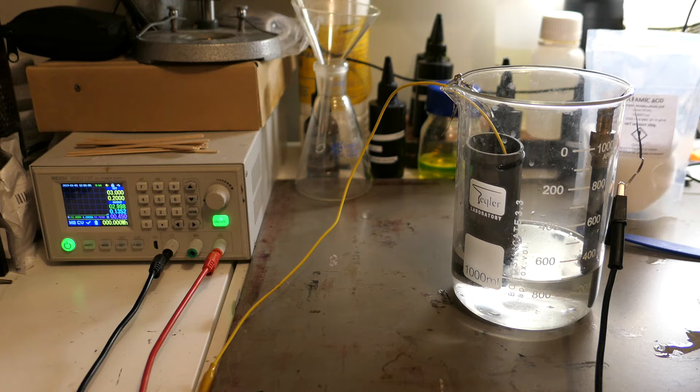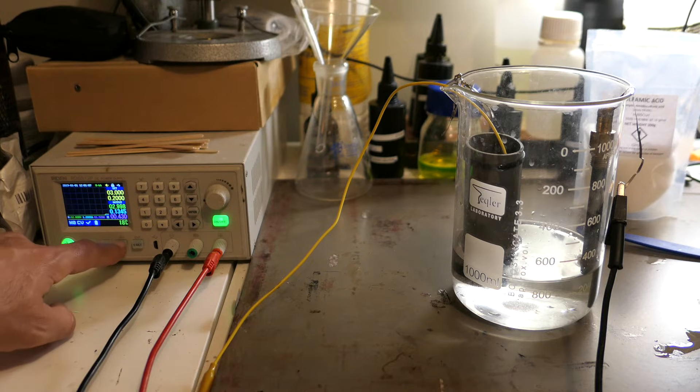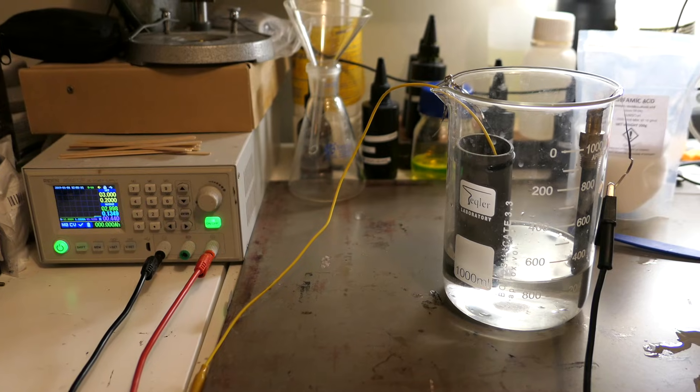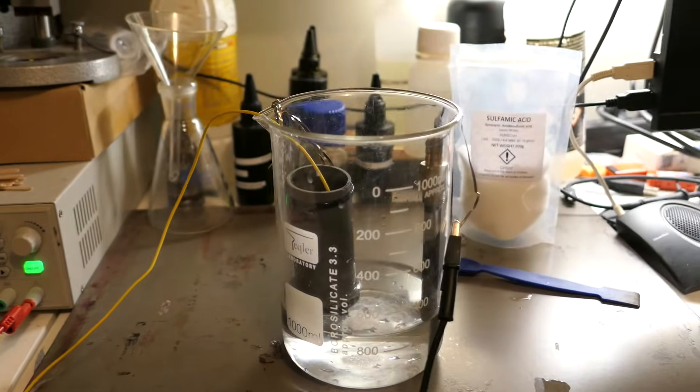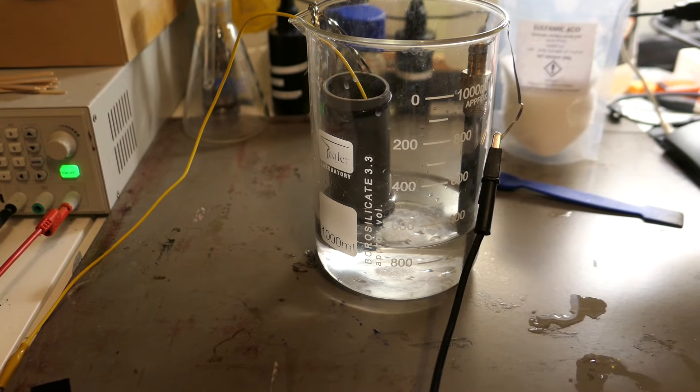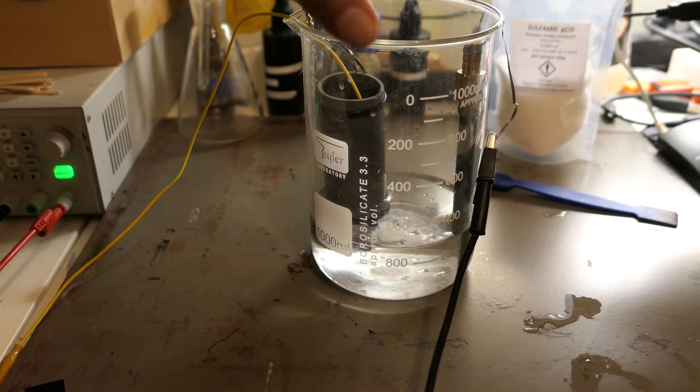Once everything is set up, we can start the electrolysis and then we'll let it run for several hours. Over time, we'll see silver start to deposit on the graphite cathode. At first, the silver deposit is pretty small, but as time goes on, it grows steadily.